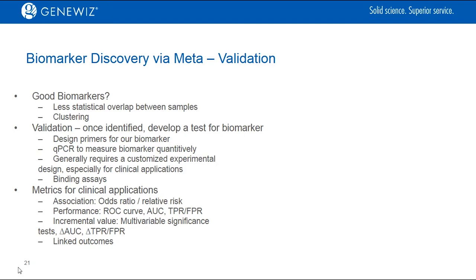Here I'll briefly go over the approaches and considerations in validation. But like I mentioned, this is not done through a generalized bioinformatics method. Rather, a validation often needs to be designed specifically for each experiment and performed in the lab. So we've learned that biomarkers can be distinguished through statistical or machine learning approaches, and that we're looking for clear statistical discrimination between conditions to define a good biomarker. Or through machine learning approaches, we want clear clustering or classifications of our conditions. Again, validating a biomarker entails designing tests specific to your experiment, data, and type of biomarker.